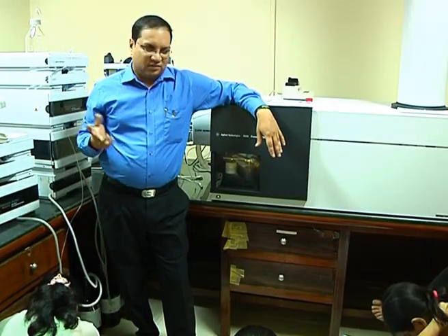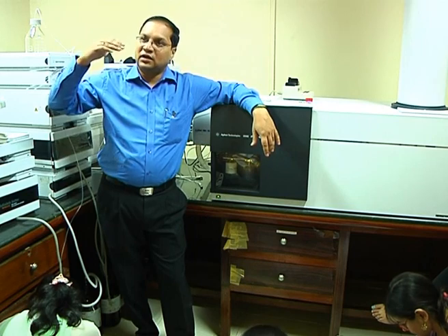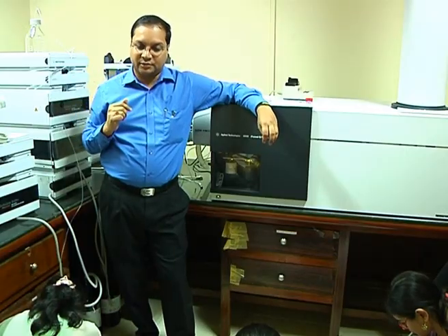That is one way. Nowadays, mostly no one is using that PMF approach for the simple reason that redundancy will rise. Based on only accurate mass might not be sufficient. You may have to trigger something.